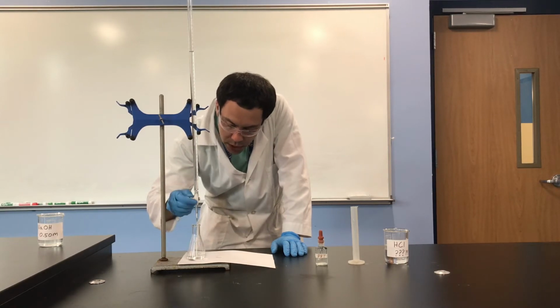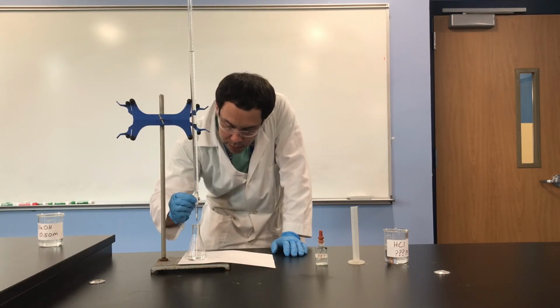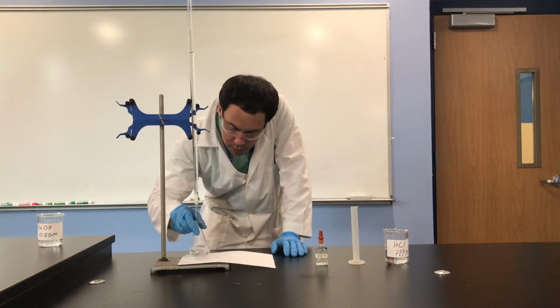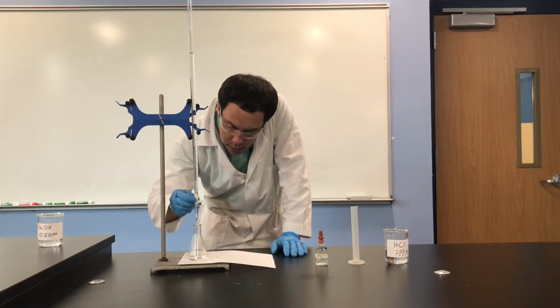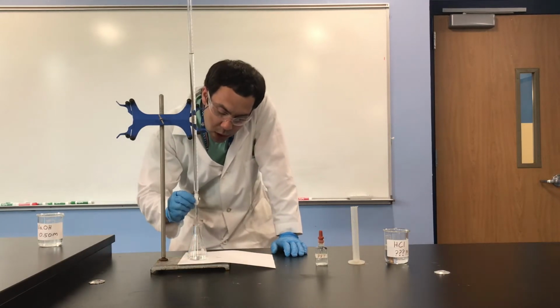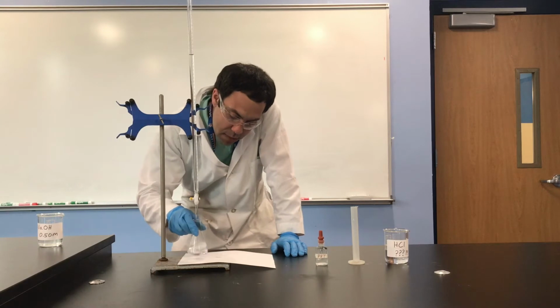That's when I know I'm done. Getting closer, but still not there yet. I know I'm not there yet because every time I swirl it, the pink goes away immediately.